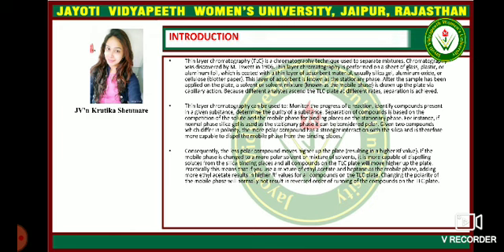If the mobile phase is changed to a more polar solvent or mixture of solvents, it is more capable of dispelling solutes from the silica binding places, and all compounds on the TLC plate will move higher up the plate. Practically, this means that if you use a mixture of ethyl acetate and heptane as a mobile phase, adding more ethyl acetate results in higher Rf values for all compounds on the TLC plate. Changing the polarity of the mobile phase will normally not result in a reversed order of running of the compounds on the thin layer chromatography plate.